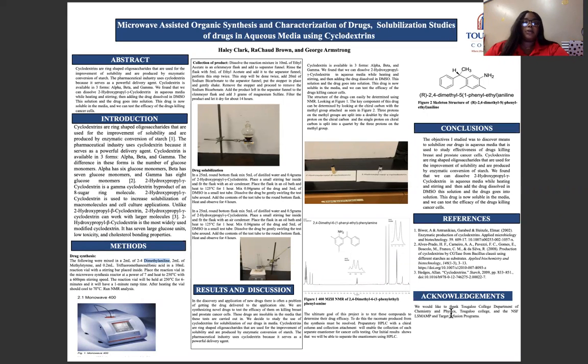I will be presenting my poster on microwave-assisted organic synthesis and characterization of drugs, and solubilization studies of drugs in aqueous media using cyclodextrin. Cyclodextrins are ring-shaped oligosaccharides that are used for the improvement of solubility and are produced by enzymatic conversion of starch. The pharmaceutical industry uses cyclodextrin because it serves as a powerful delivery agent.